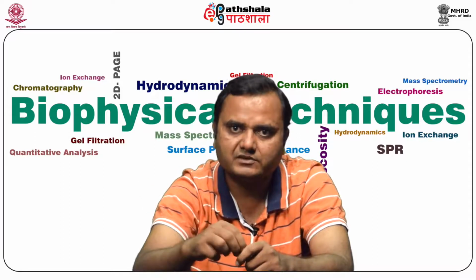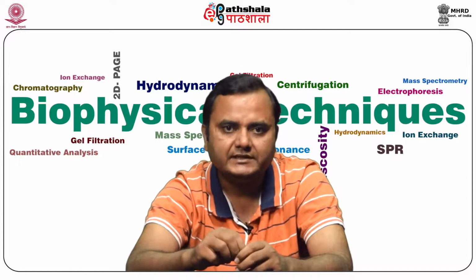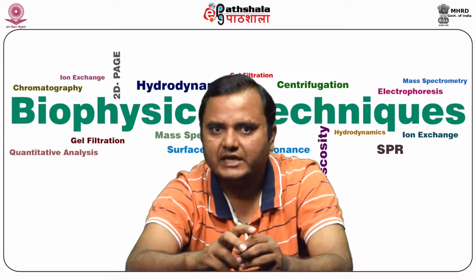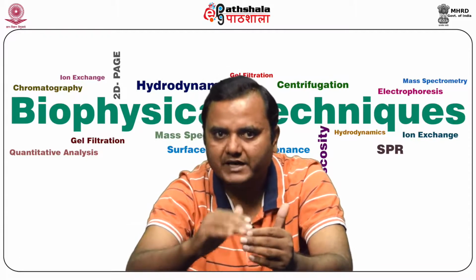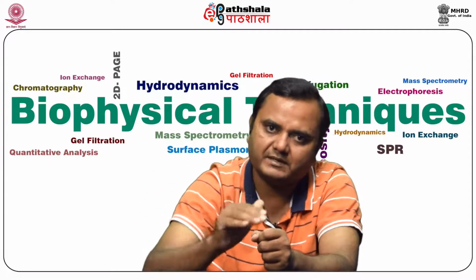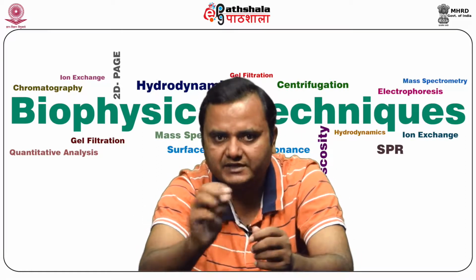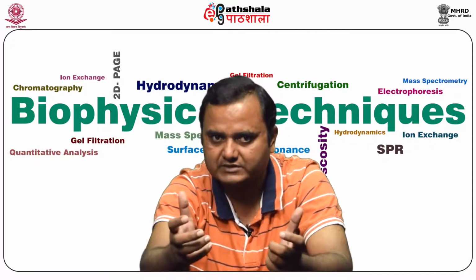As the concentration of the compound increases, the density of the medium increases in the tube. Density is low at the top and high at the bottom, and macromolecules centrifuged through it will form a band once they reach the buoyant density corresponding to their own density. They stop at a particular position, which is useful for separating molecules of different densities even when the densities are very close.